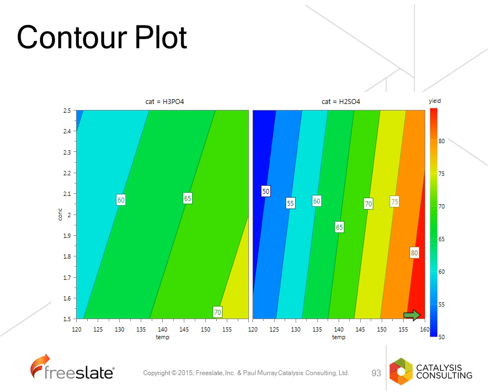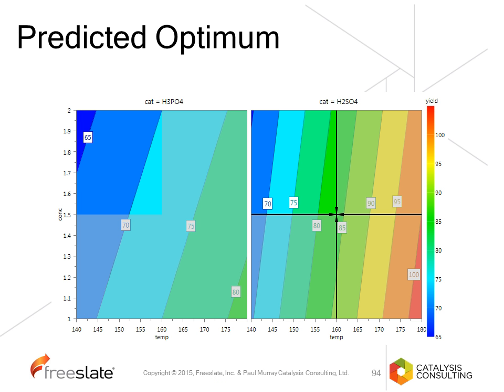The advantage of having carried out experimental design is that this can now predict where you should actually operate this process. So the predictions that are made based on the design that we have carried out is that if you reduce the concentration further and you increase the temperature, you can actually get 100% conversion.